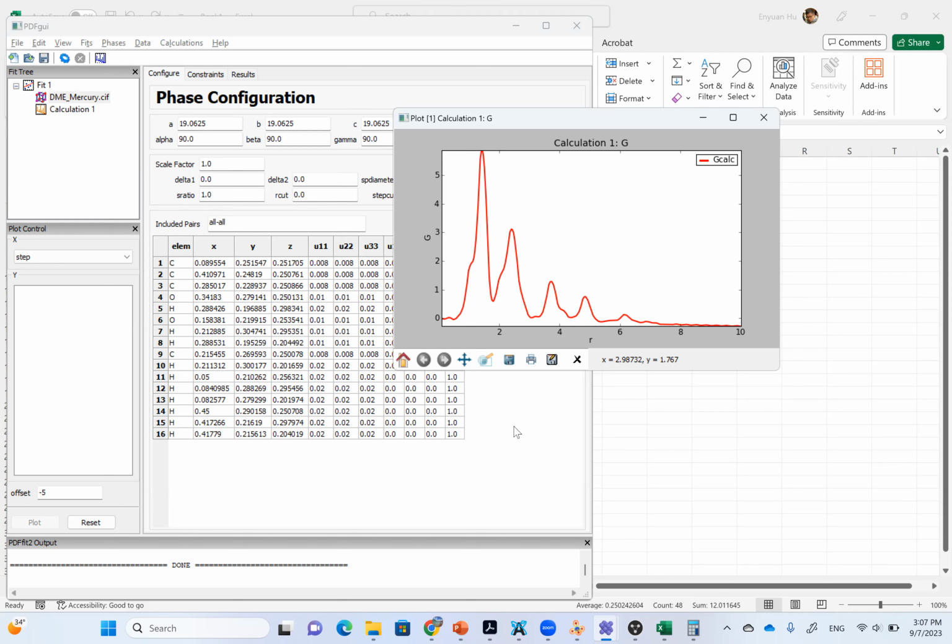Sometimes I do a Gaussian calculation, which can also give the PDB file, and then trick Vector, and also Mercury, into producing a crystal structure for us, right? And then feed the PDFGUI with the crystal structure, but try to avoid the overlap between different molecules by expanding their cell dimension, and don't forget to change the fraction coordinate for atoms.